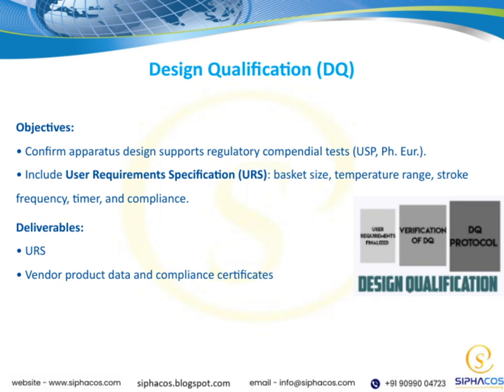Moving on to the deliverables, we expect to have the URS itself, which guides the entire qualification process. Additionally, we require vendor product data and compliance certificates. These documents verify that the equipment meets the specified standards and is suitable for our intended use.